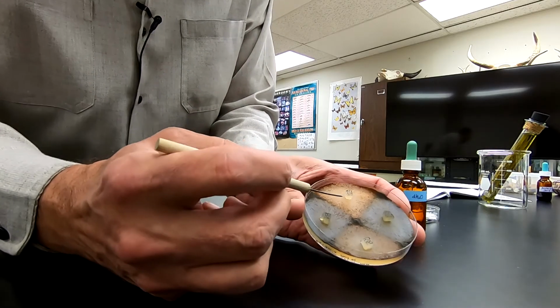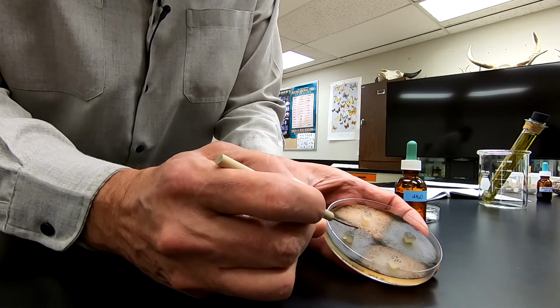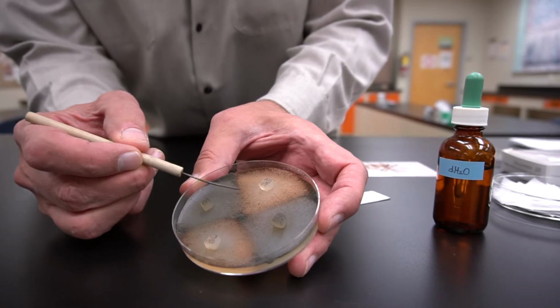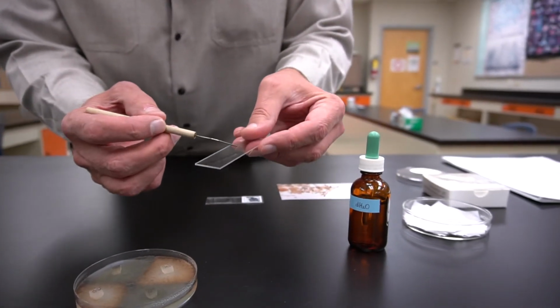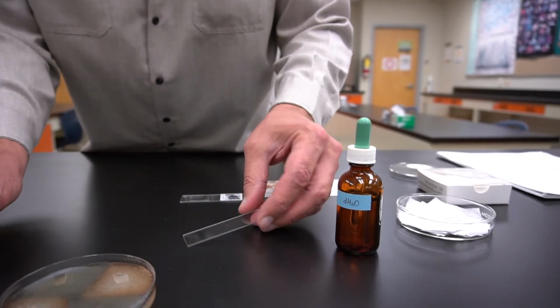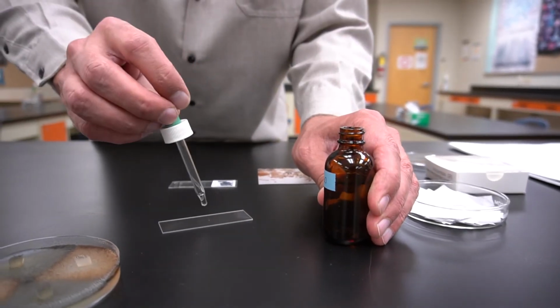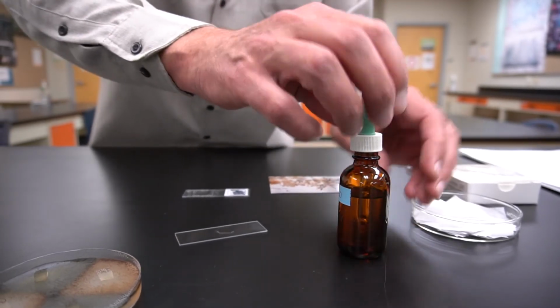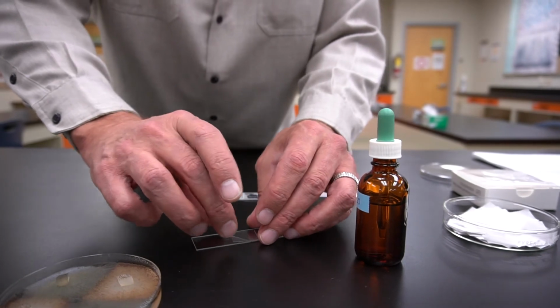In the lab, and I'll be showing you later, what you would do is you'd scrape off some of these perithecia. You'd place them on a clean slide. You'd add a drop of distilled water. You'd add a cover slip.